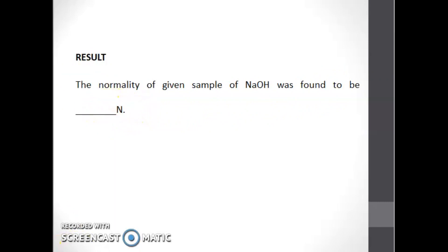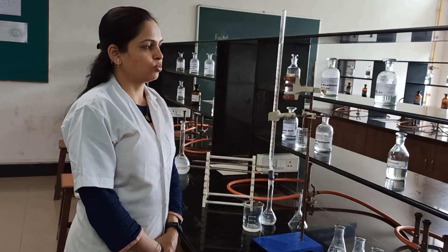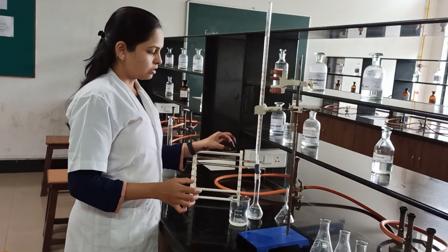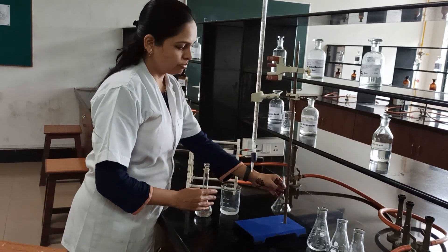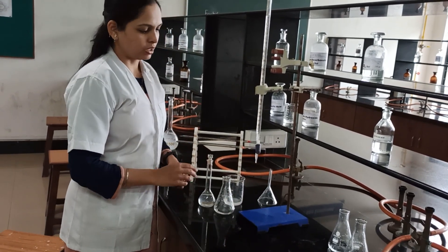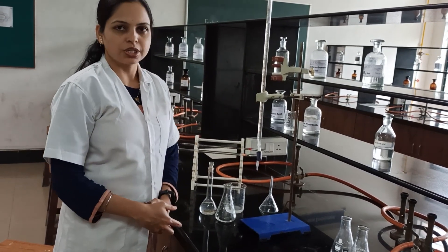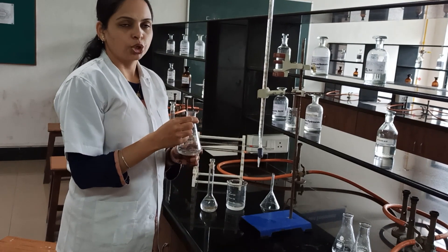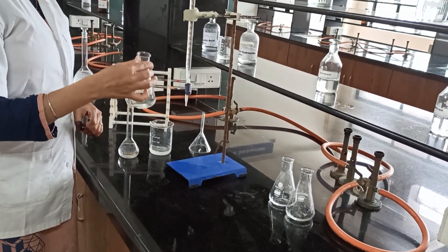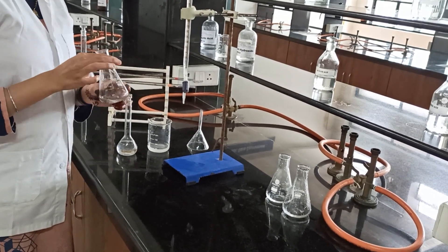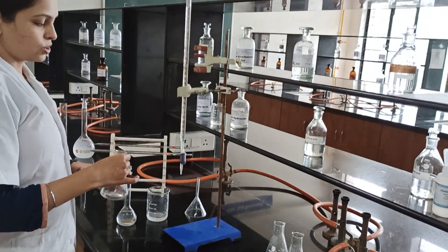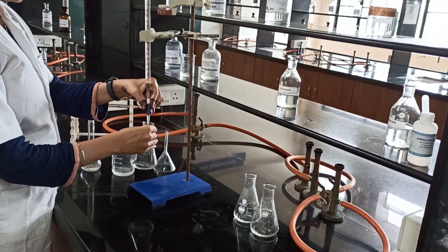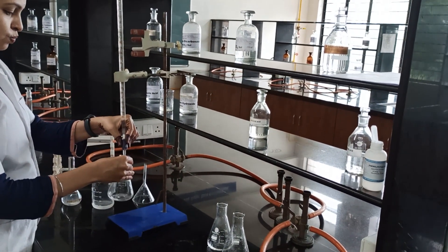Now we will proceed for the practical part. The procedure for standardization of 0.1 normal NaOH is: take 0.1 gram of potassium hydrogen phthalate, dissolve it in 15 ml of water, add 2 to 3 drops of phenolphthalein indicator, and titrate this content with the 0.1 normal NaOH. Now we will start with the titration.